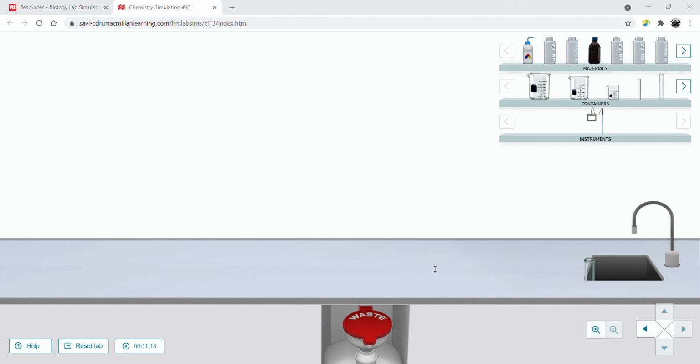Let's do that. Take 3 small test tubes, 1 through 3. So one is sodium, and how much are we adding? 5 mLs of each. Hopefully I will remember to do that. So 5 mLs of water.